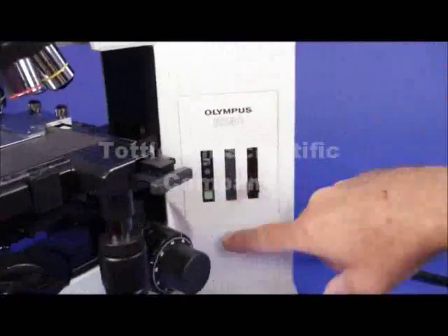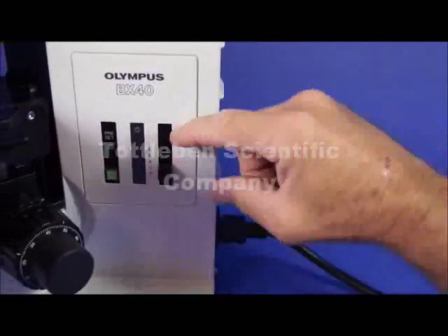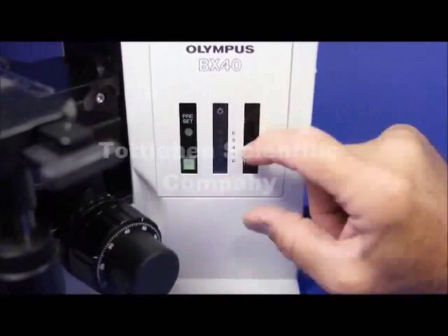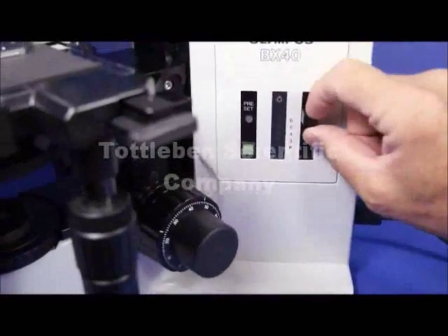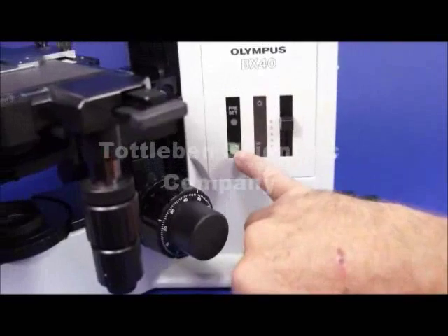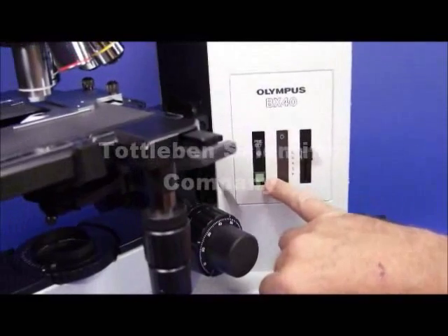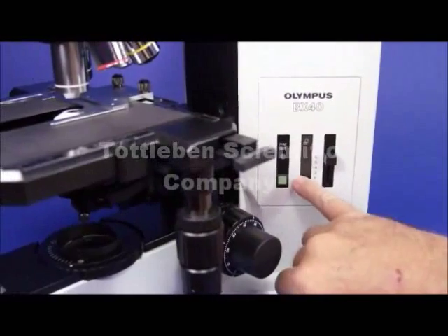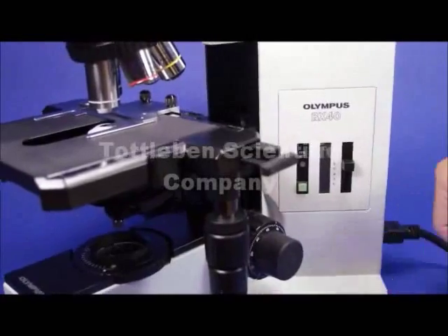Moving over to the on/off mechanism, you've got an on/off switch in the back, and then a rheostat controlled with this knob right here. If this were plugged in, you would see all these LEDs light up as you increase the intensity. It's also got a preset mechanism — if you're the only user and you like to come in every day with a preset illumination, you just push that button and it comes to that intensity every single time you turn the microscope on.